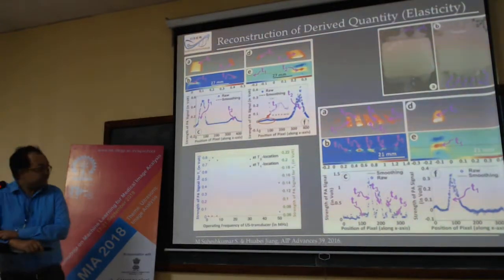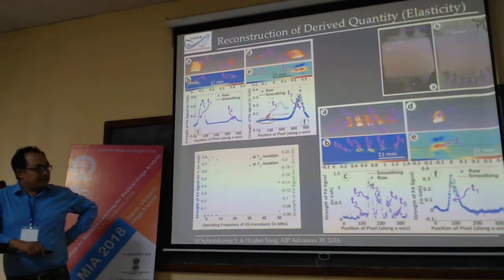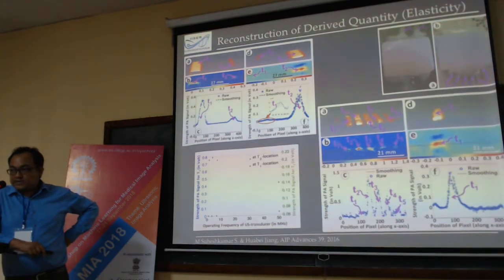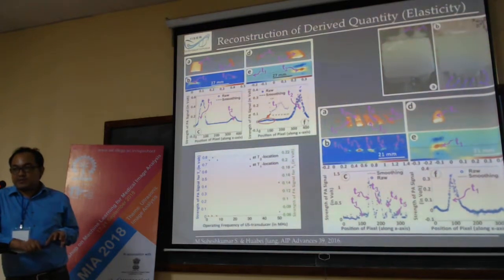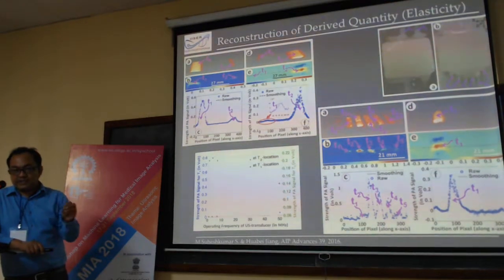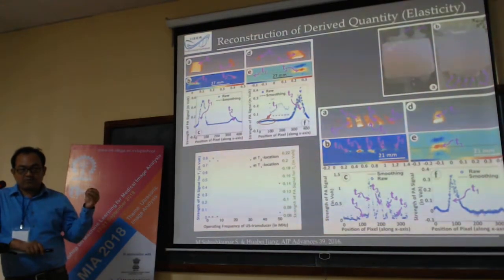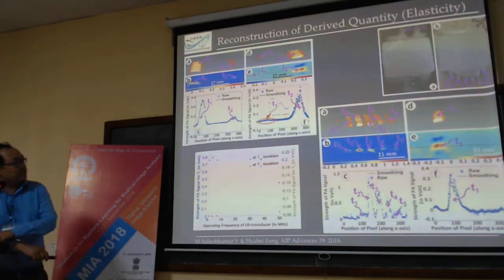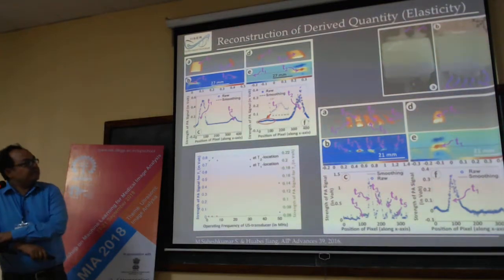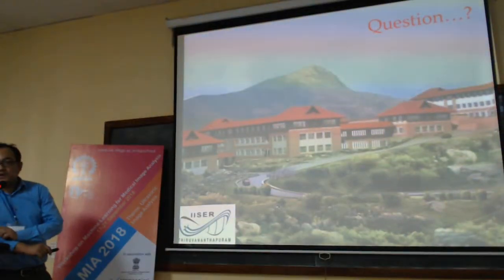Another challenging thing in photoacoustic imaging that people are trying to address is how to discriminate the contributions of the physical parameters to the detected signal. It is contributed by the absorption coefficient, elastic coefficients, and temperature. Then, for an unknown sample, from the detected signal, how do we segregate the contributions from the different parameters? That is also one of the research areas people are looking into. Yeah, so for this, I stop over here.